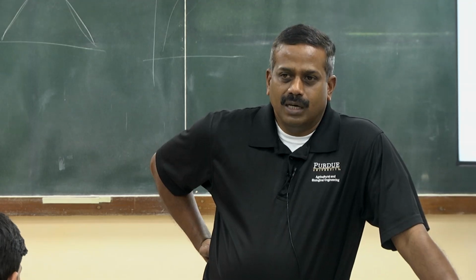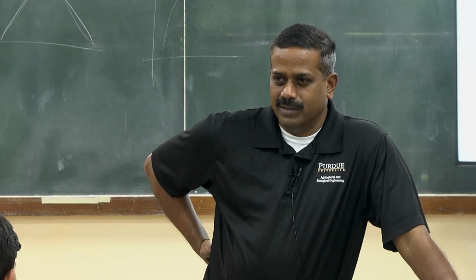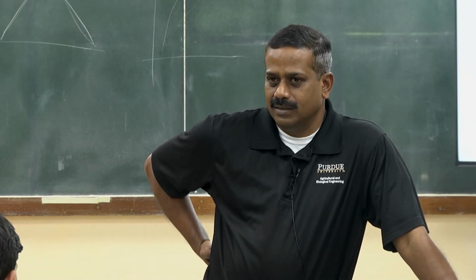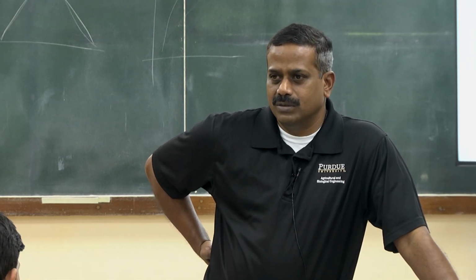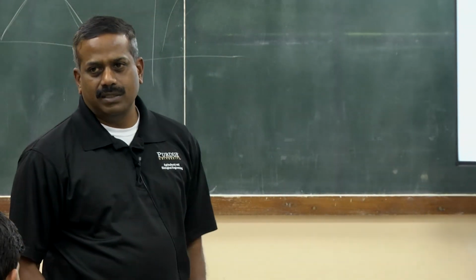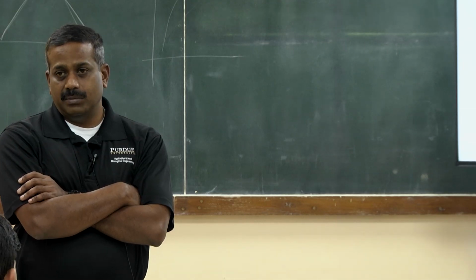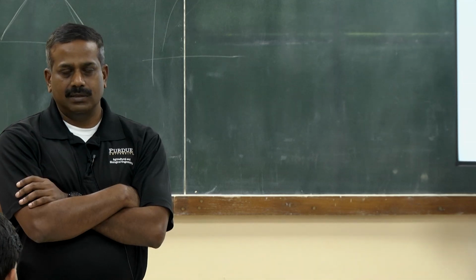So we do have almost all types of characterization instruments. For particle size, we have at least five or six different types of instruments to measure size, size and shape characterization, and density characterization. For flow, we have four or five different instruments to characterize flow of powders. Most of the instruments are listed on the website. And some people work on modeling, both discrete element and finite element modeling. That's also a big area of research.